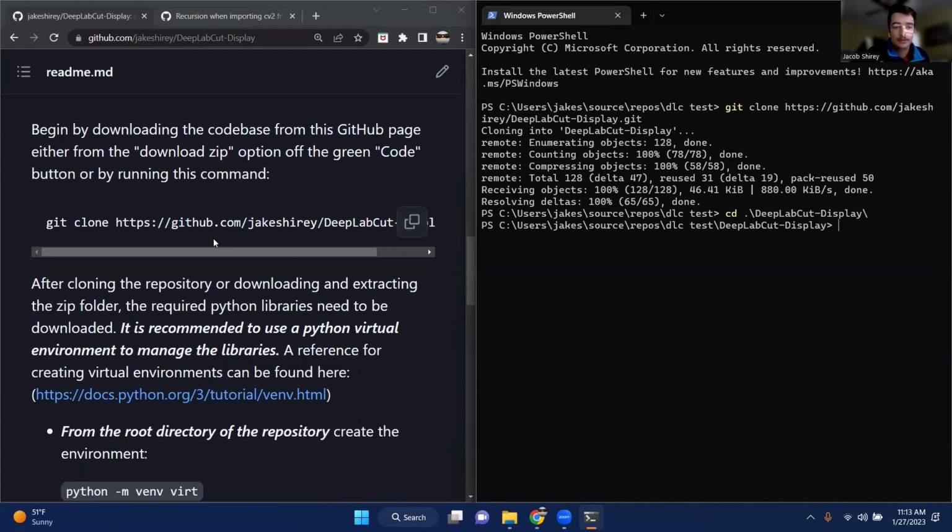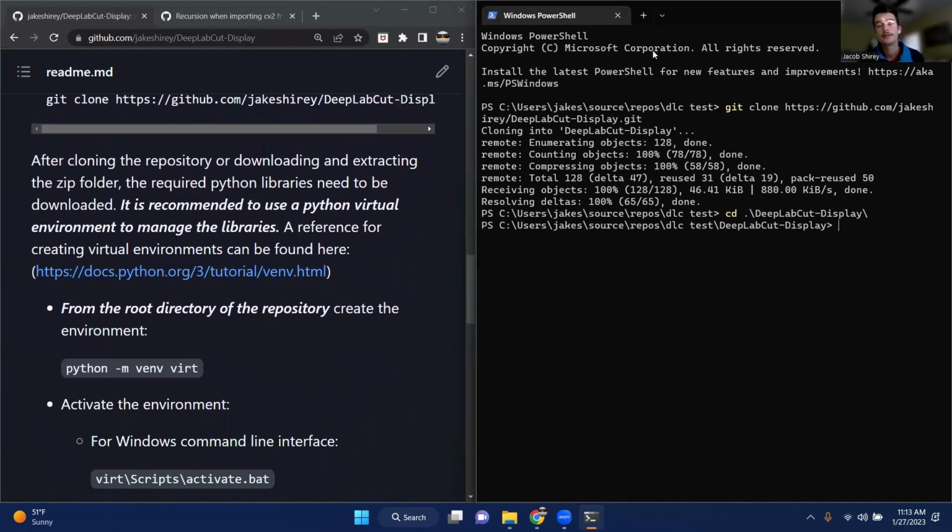And what I'm going to do is create a virtual environment. So a Python virtual environment is pretty much a resource that manages all of the Python libraries that you have installed. And so it creates an independent environment so that whatever other libraries or packages or versions of Python you might have on your computer, they don't interfere with what you're going to do with this project. So it keeps it all very modular. And we're going to be using that because we have a bunch of different packages that are used to run and compile the Python code.